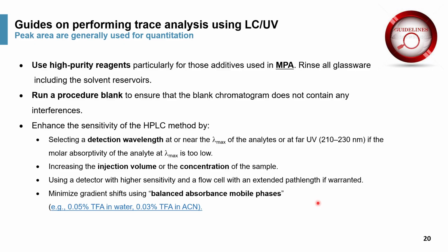However, for normal operation, for a purity assay, that really does not help because you can saturate the detector very easily with your main component.